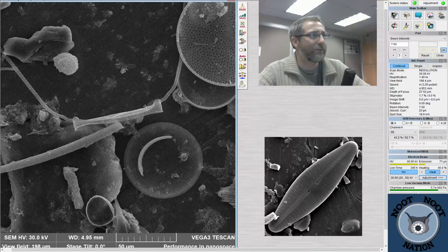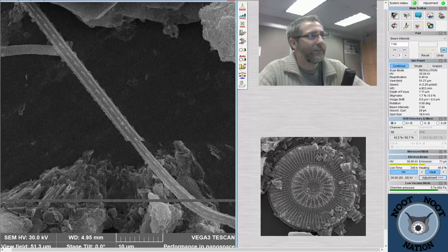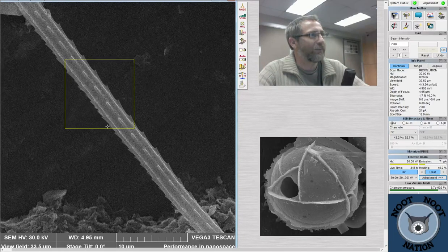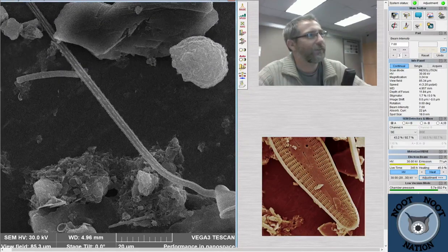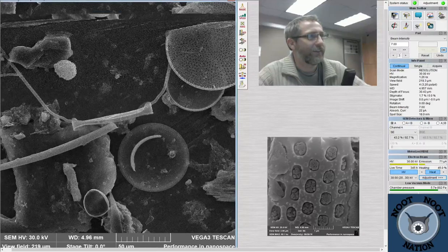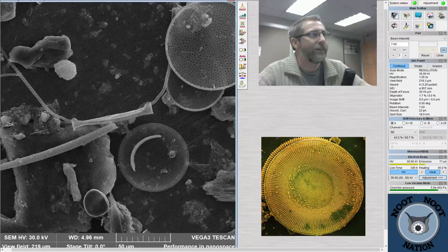And we're going to zoom in on this one because this one's kind of cool. It's really shallow, like a short valve, skinny this way, with these really long setae on it. And if I zoom in on the setae, what you'll see is that they look dangerous. They look like a barbed wire fence holder. But they use these notches to interlock with their neighbor valves a little bit. And so you can kind of see that cool structure to the setae on this one. You can also get a sense of how long the setae can get for some of these Chaetoceros species. So this one is a very skinny little guy in terms of the depth of the valve. So we're looking at it in girdle view and side view. We can see the spine sticking way off of it, and then the valve itself is actually pretty skinny.